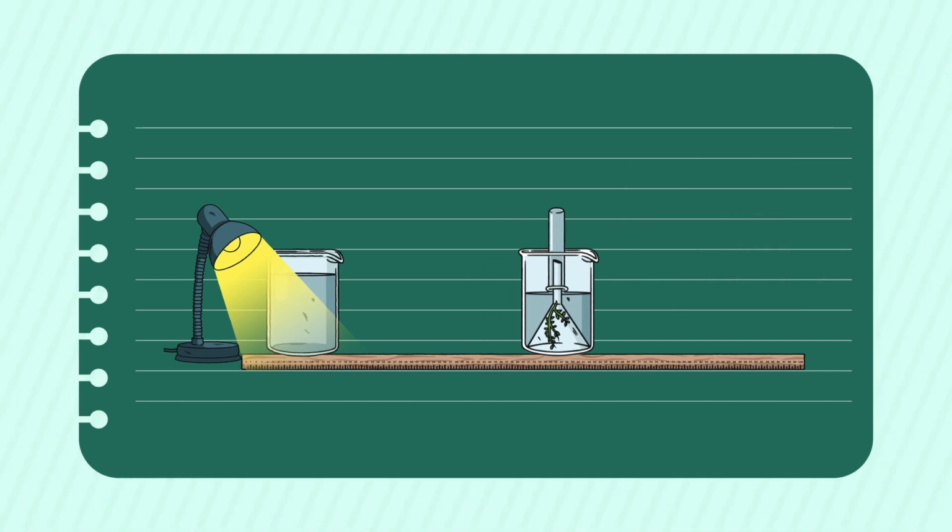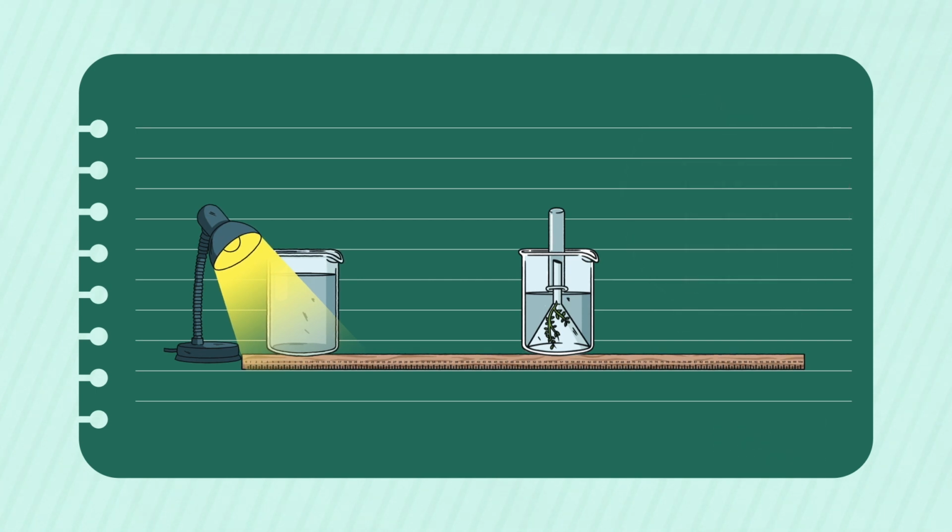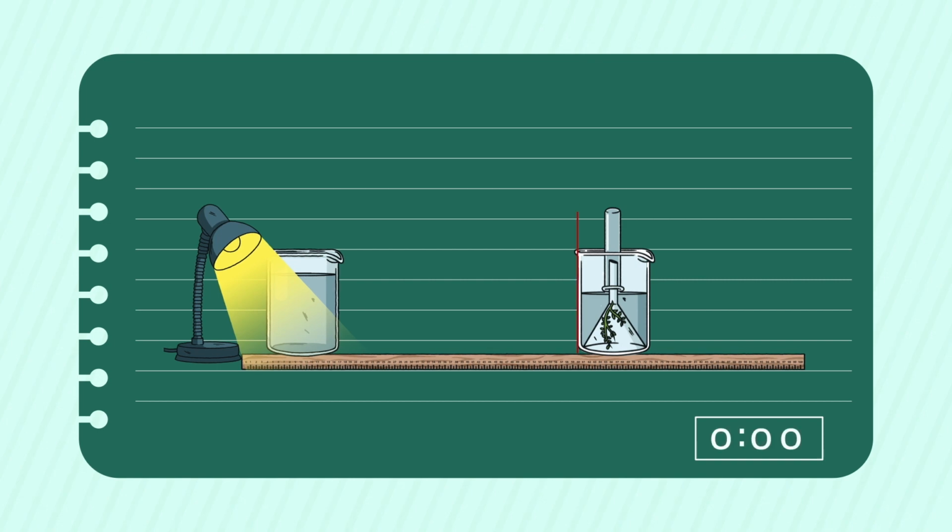Repeat this at 50 centimetres and at 60 centimetres.